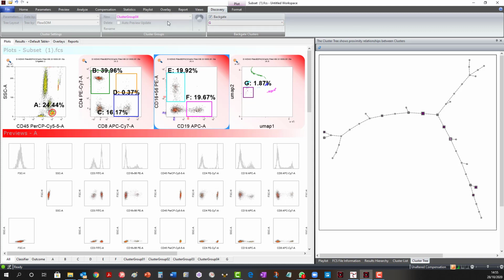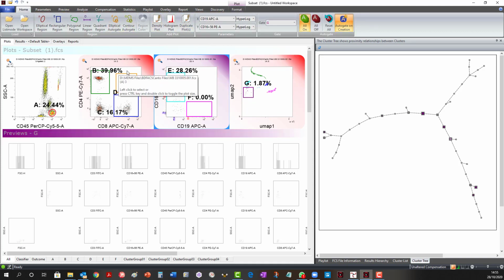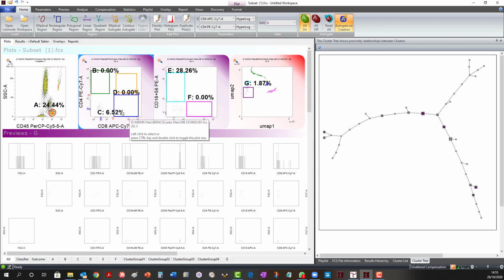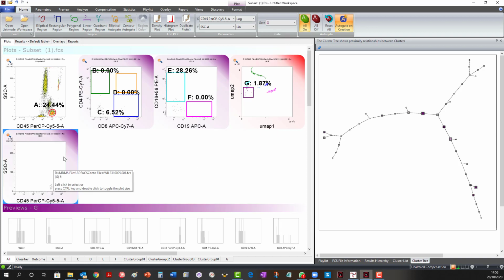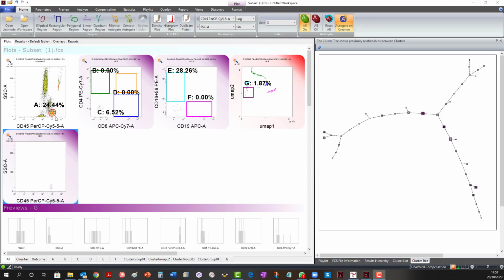And it is showing these events in the negative area on both plots, suggesting that they may not be lymphocytes or typical lymphocytes. Looking into this a little further, the events definitely are part of the lymphocyte population, but appear negative for 4, 8, 16 and 19. Feel free to comment and tell us what you think these might be and why.